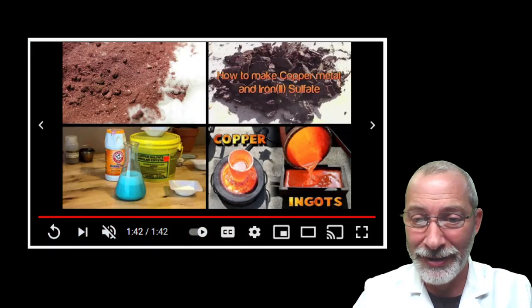So I'm going to get off the rest of those videos that might be coming to remind you, if you need to replay that little segment, think about it. Think about your observations for your lab and think about the mathematics. Remember, hint, hint, the law of conservation of mass here. What do you think is happening and what can account for any changes that take place? We'll discuss this later, but be sure to write down all of your information in your observation section.